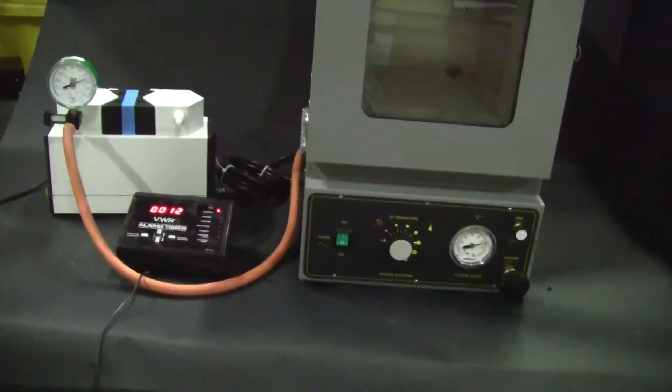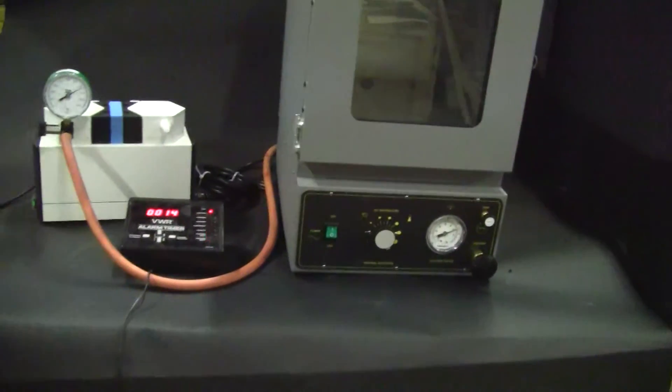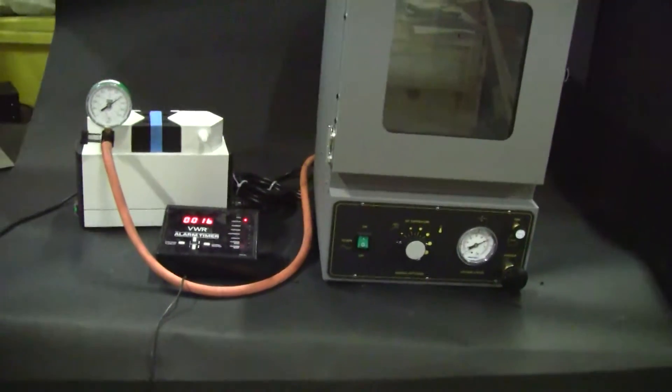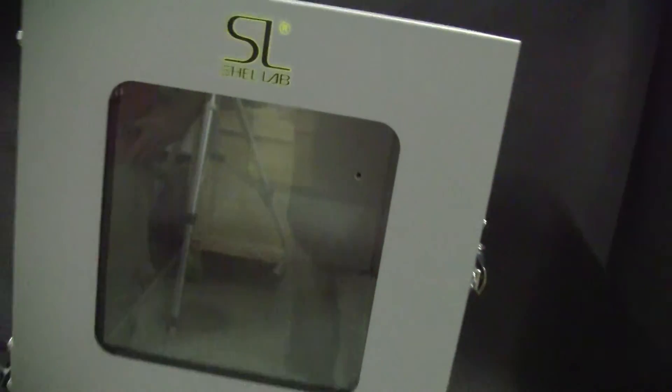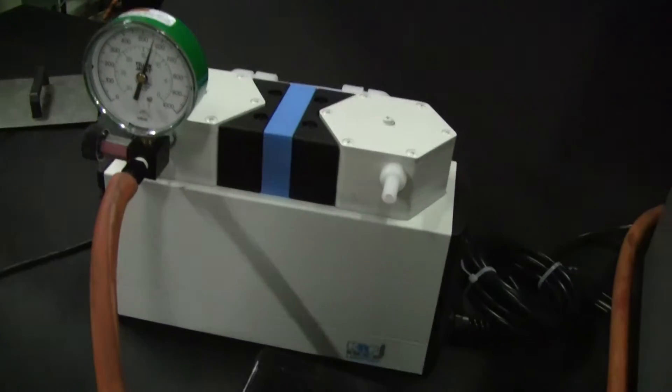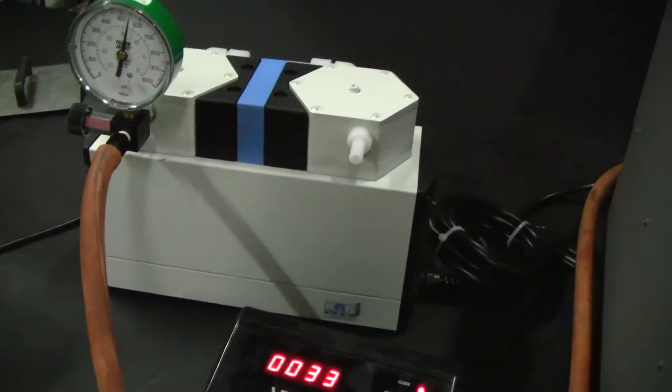What I can tell you about the vacuum oven: it runs on 115 volts, chamber size 9x9x12, 0.6 cubic feet. The lab port vacuum pump, 8 millibar ultimate vacuum, 20 liters per minute. That also runs on 115 volts.